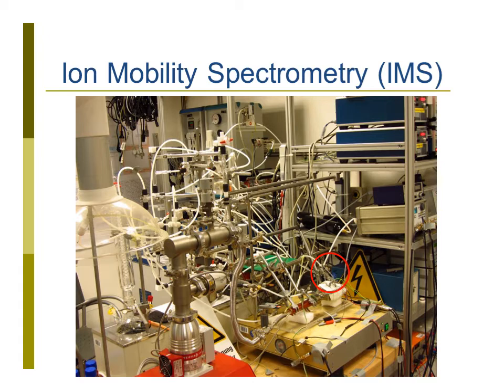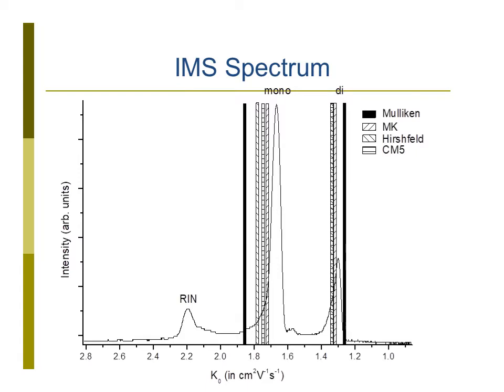Good. This all works fine, but here you see a typical spectrum, how it can look. There's always some signal that's always there. These actually these ions that ionize later your sample. And they're always there. And then your sample gives one or two or more spectra.